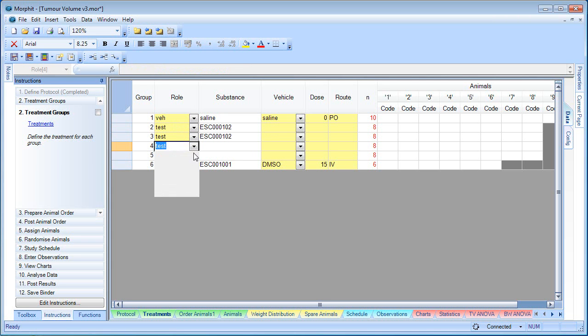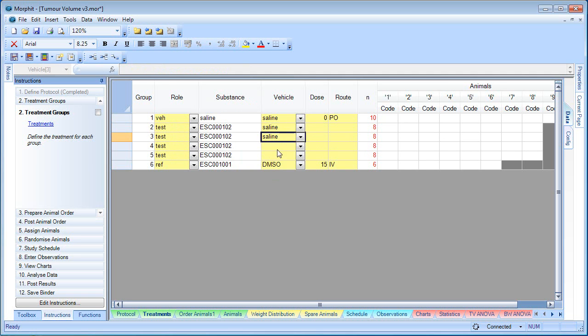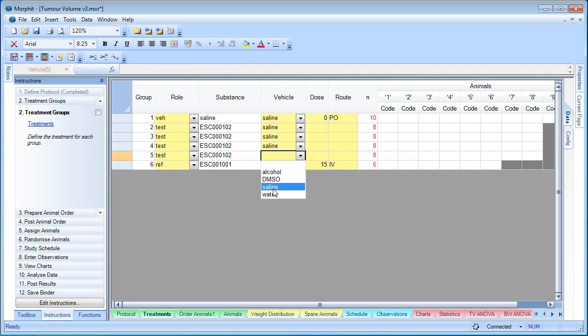As you can see, as we select each role, the compound associated with that role is entered in the substances column. Dose.